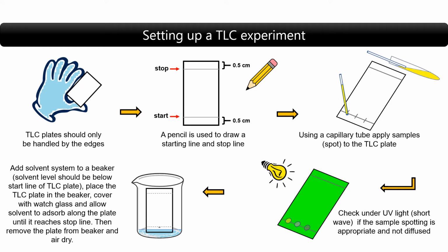Here I will be walking you along the steps of setting up a TLC experiment. Now, this is a TLC plate, and you should always remember to handle the TLC plates only by touching the edges of the plate.